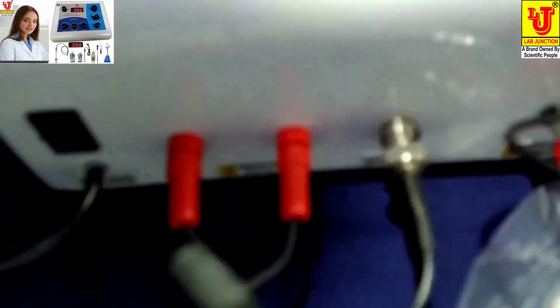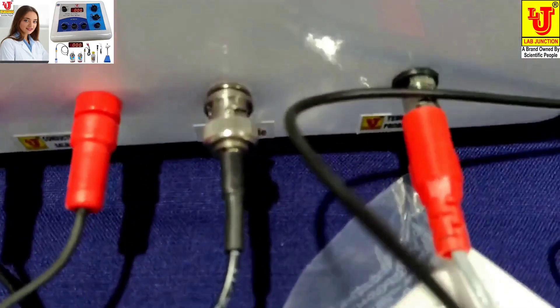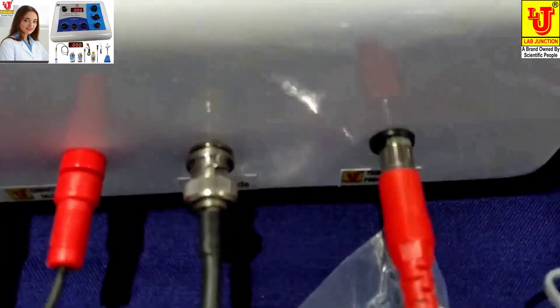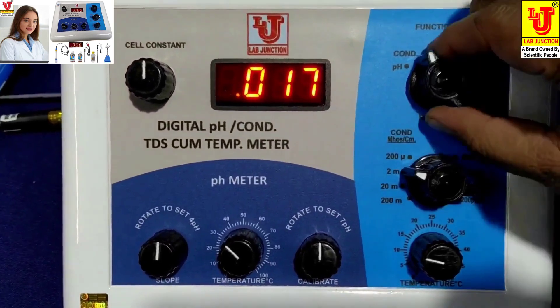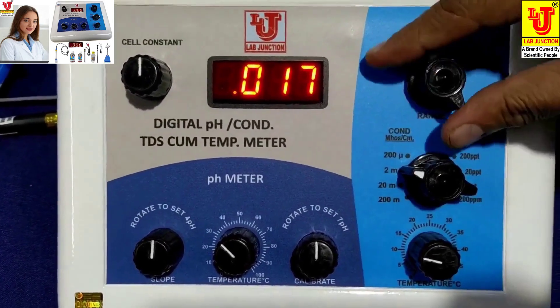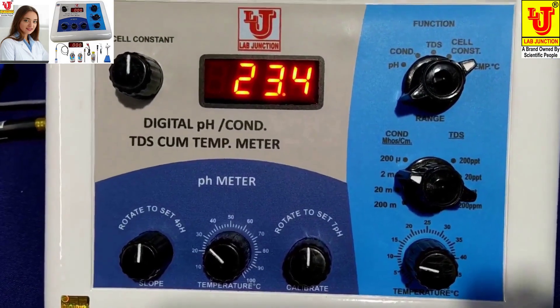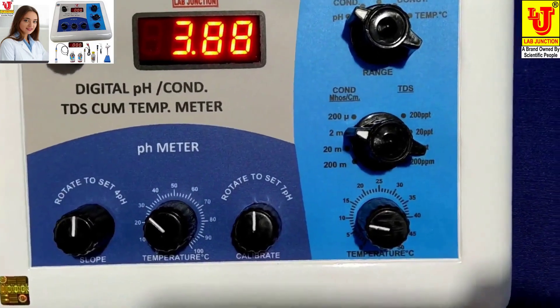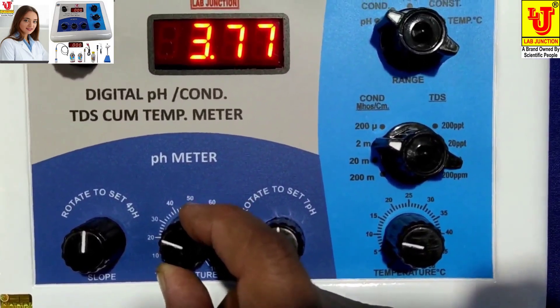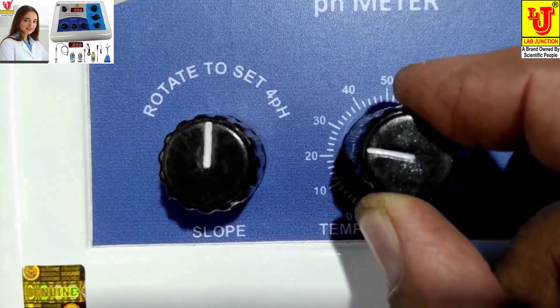Now this is the conductivity/TDS salinity cell. The function control selects pH, conductivity, TDS, and temperature. Now this is showing temperature 23.3°C. Now I am standardizing the pH value. For pH, first you have to set your temperature.